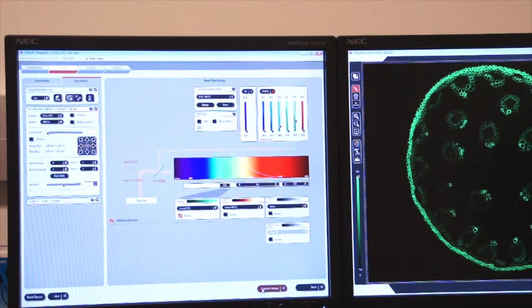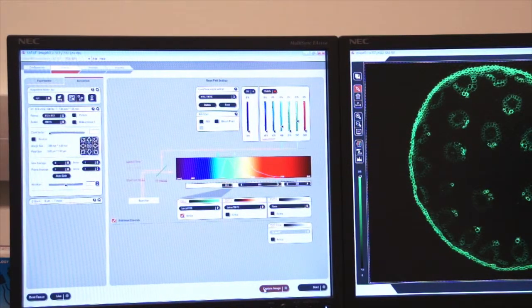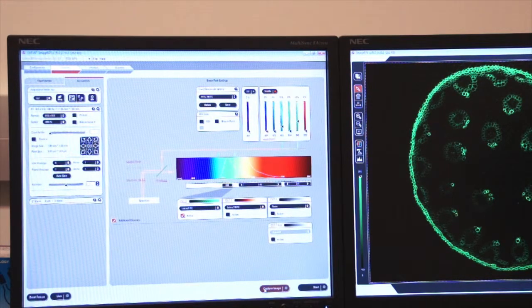The more scans you do per line and per frame, the slower your image will be. Let's go back to line average and change that back to one.